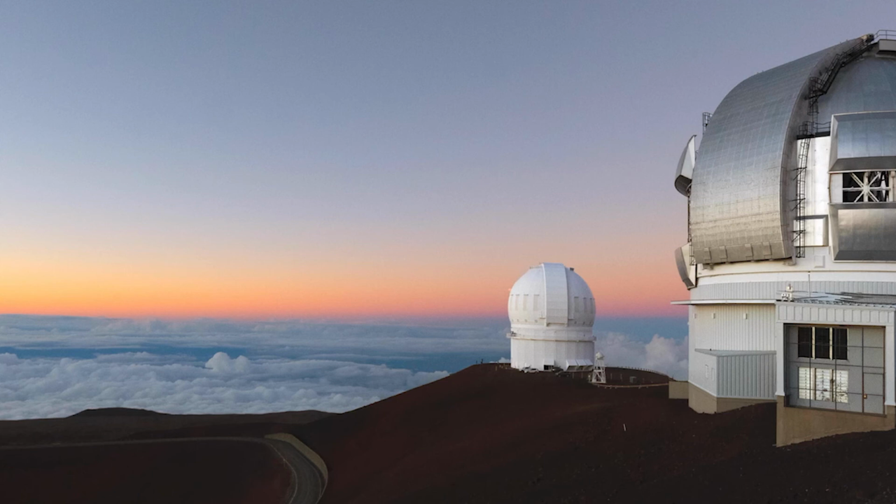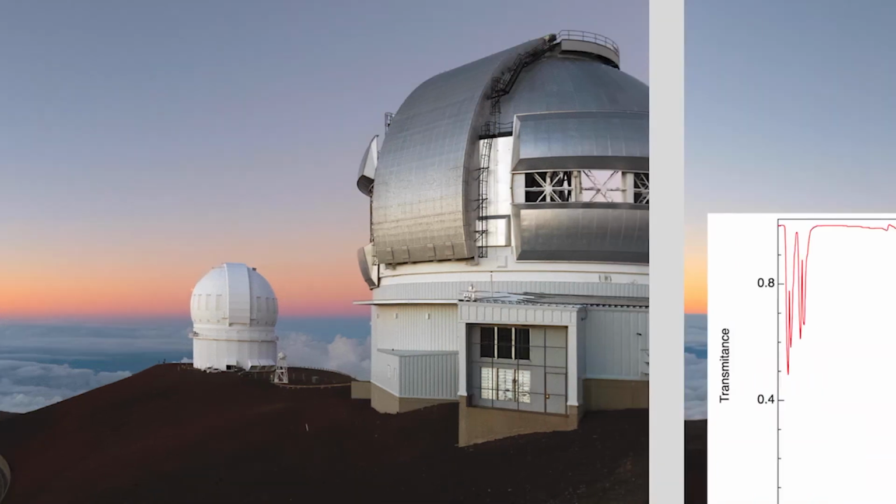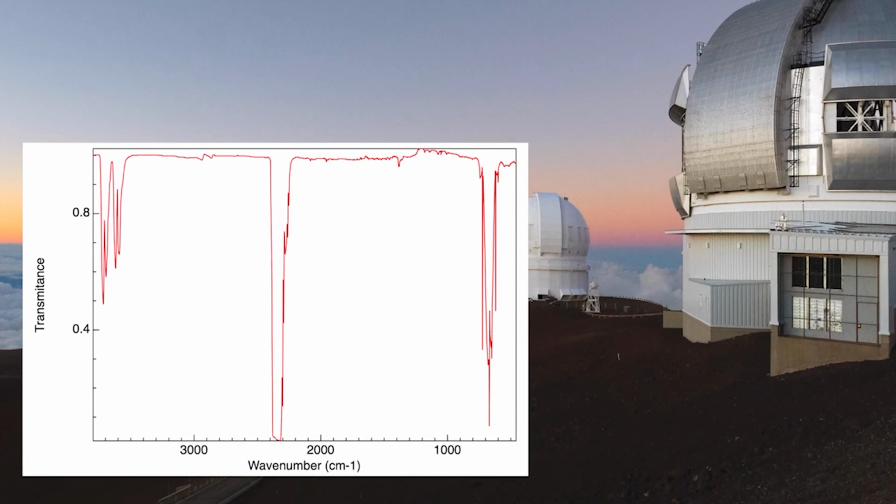And in the case of carbon dioxide, we can use infrared spectroscopy to measure the CO2 concentration in the atmosphere. And this is, I'm going to pronounce this wrong, Mauna Loa Observatory in Hawaii has been doing this for about 50 years. It's at an altitude of around about 4,000 meters. Isn't that a fantastic photo? So there's very little interference with carbon dioxide concentrations fluctuating from day to day because of human activity or vegetation. Around about, there is none. Air samples are collected every hour, and the carbon dioxide concentration is monitored.